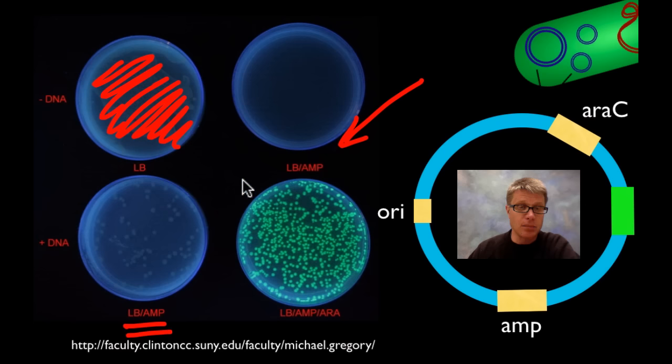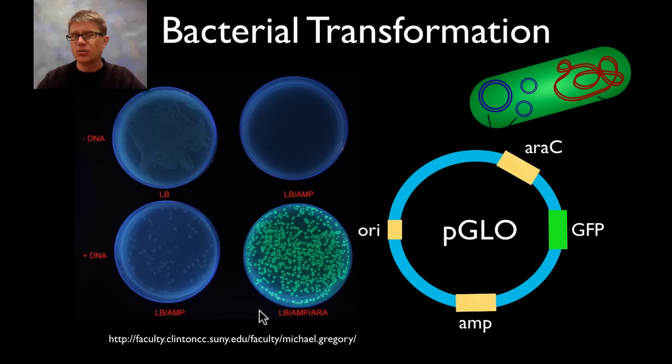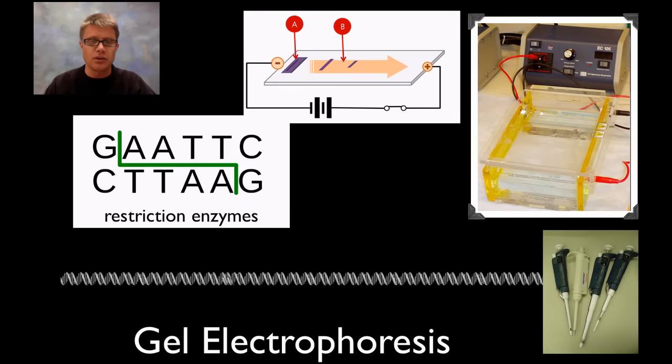Likewise on the ones who have the LB and the ampicillin, the ones that are transformed we're going to see some colonies. So each of these colonies represent one bacteria that picked up the plasmid. It's able to make copies of itself and it's able to grow. So you can see not a ton of them were able to do that. But then finally we get the really cool plate where we've got LB ampicillin. So all these bacteria were transformed. But we also have that arabinose sugar. So they're able to use that to produce this glowing protein. And so you get this fluorescence in the bacteria. So what do you need to understand? What a plasmid is, how it transforms bacteria, and then how that might be manifested in all the different growth on all the different plates.